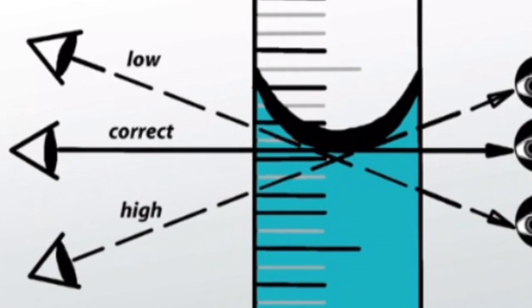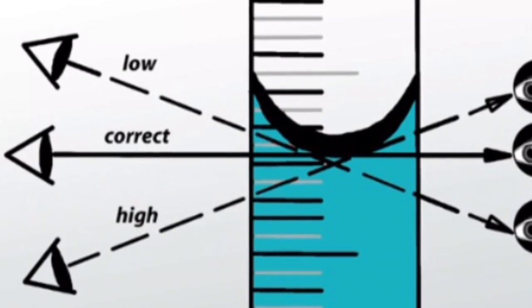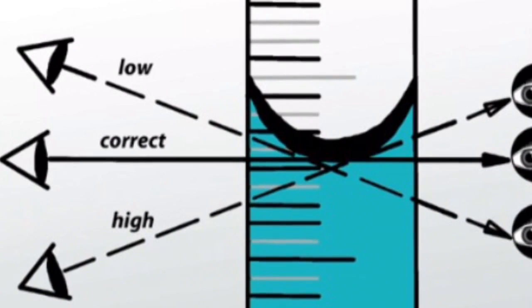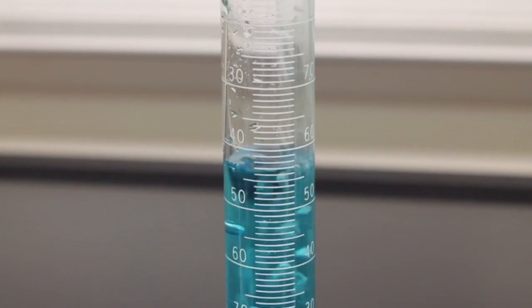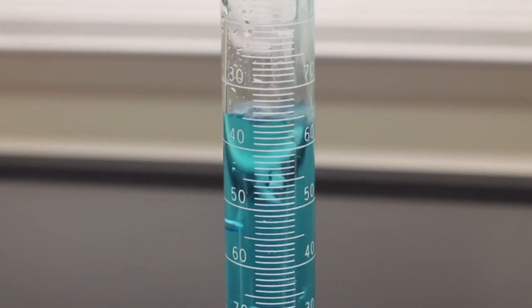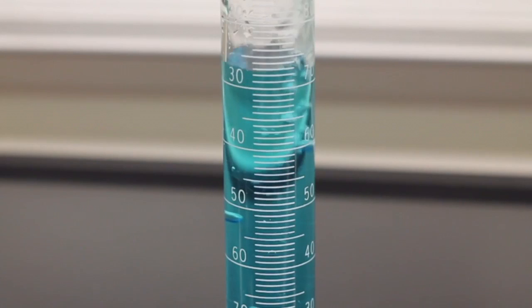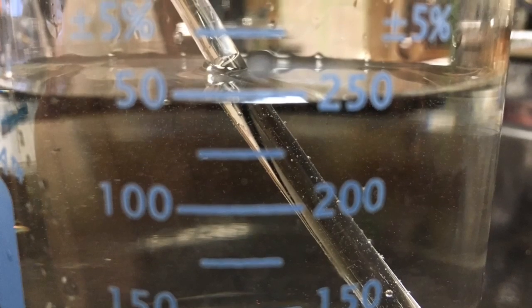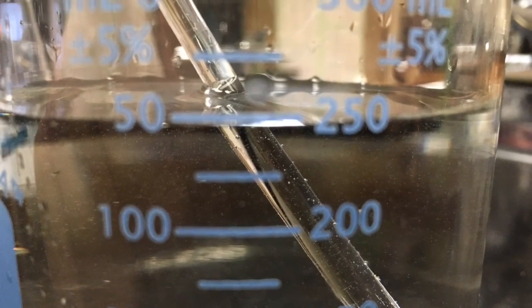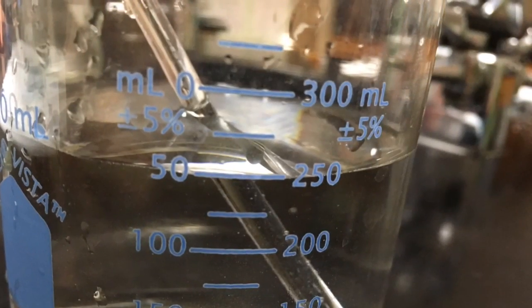One use for a beaker or flask is measuring volume. To correctly read, measure the water where the meniscus is. Don't have a beaker or flask as your go-to measuring tool because a graduated cylinder is more accurate. As you can see, there are two numbers on this beaker. Always refer to the number on the right as your milliliter volume.